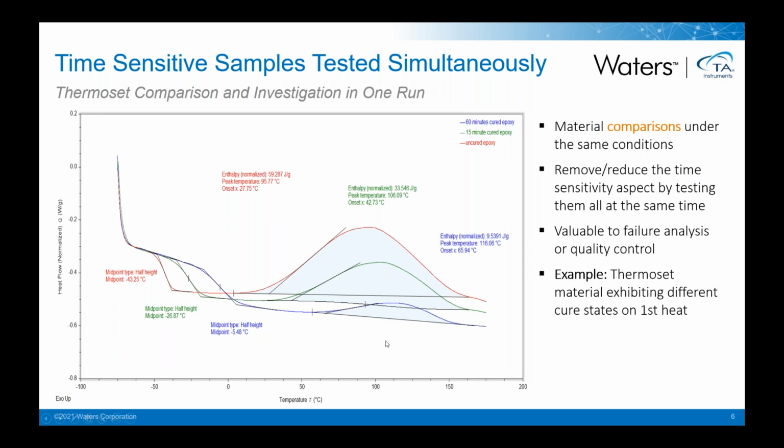And so having an established time zero certainly provides a good level of confidence, a good starting point, and the results that you then see have a lot more weight to them, because you know that you've made the measurement at the same time.